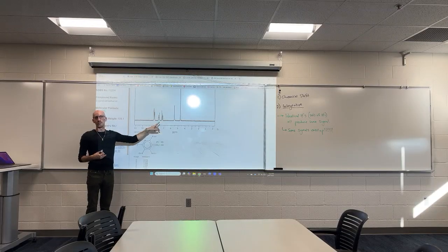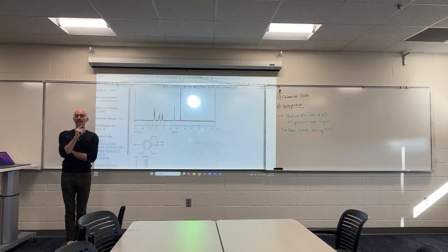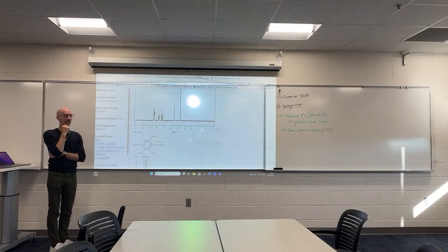So you can look at a compound and predict, this is how many unique signals I think I will have. And you will not always find that. You will often run into this issue where signals overlap with each other.